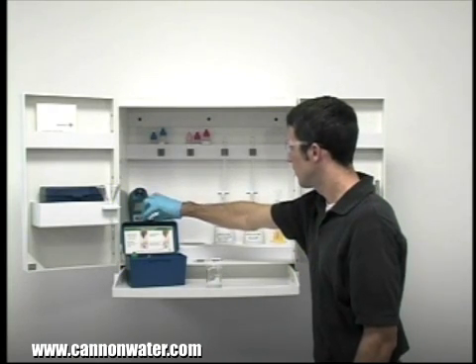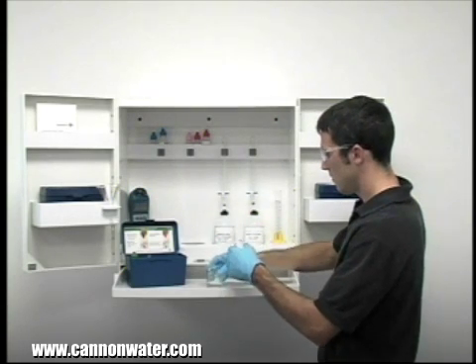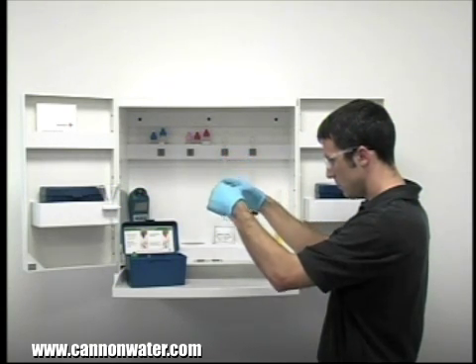To get an accurate sample size, you want to hold the vial close to eye level. Once you feel you have an accurate sample, place the vial on a level surface and bend down to eye level to make sure you have an accurate sample.